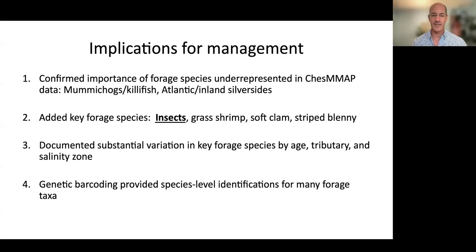We're using this not on stomachs, but on water samples to look at the biodiversity that develops around restored oyster reefs. And we're about to start a new project using this approach to look at the species that are living in the Maryland offshore wind energy area off of Ocean City before, and then hopefully seeing how that potentially changes or not with the construction of offshore wind turbines. So this approach is becoming really common and usually involves water sampling, not grinding up stomachs, but those are the data that I had to show to illustrate this today.